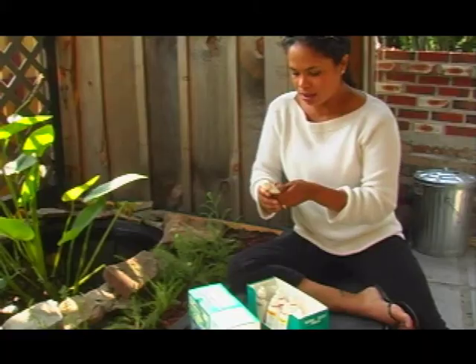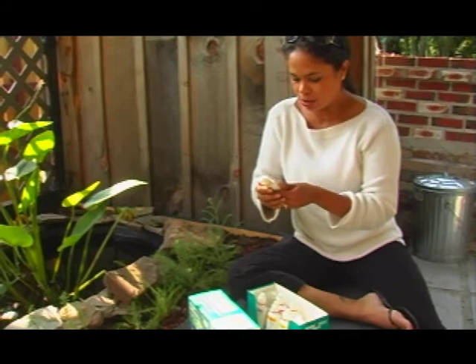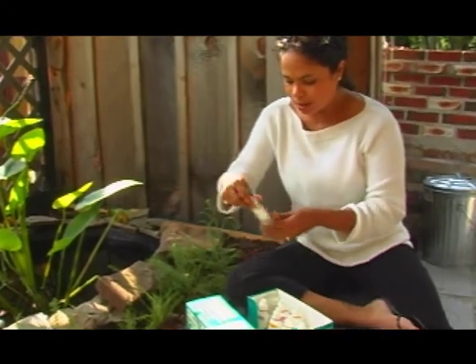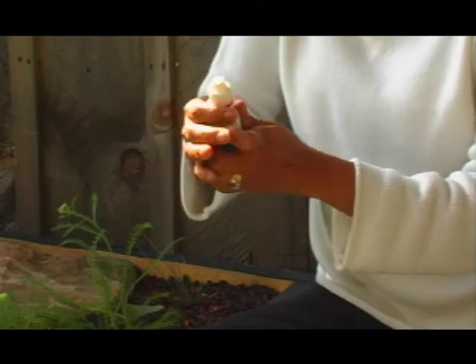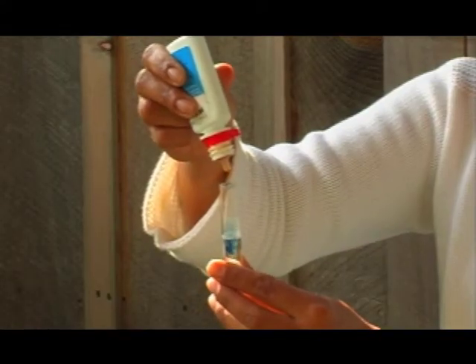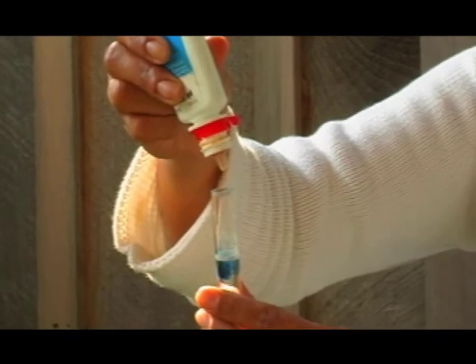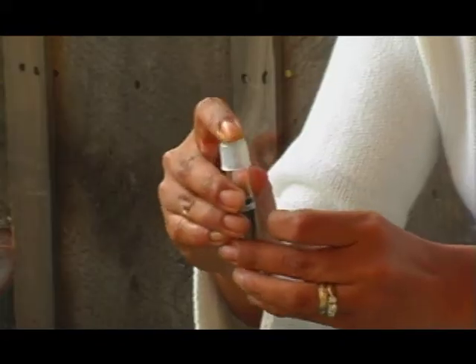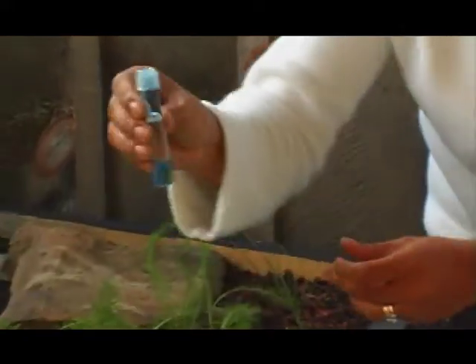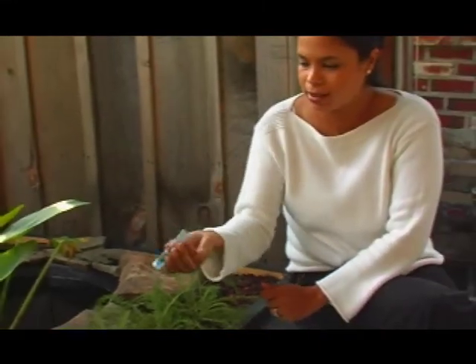Here is the pH indicator solution. Now what I have to do is I've got to take this and put three drops — one, two, three. Now I've got to cap it and then just shake it like this.